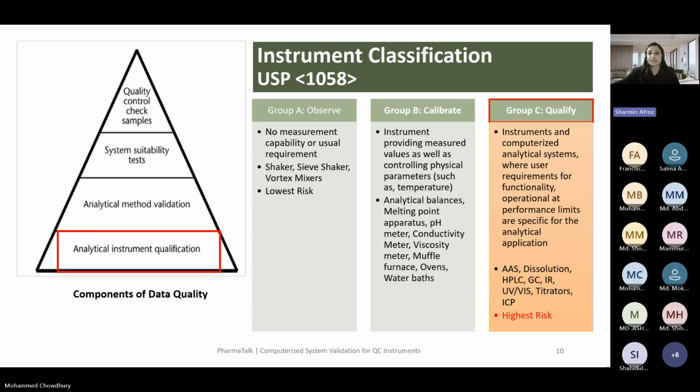Mr. Ashik Mustafa asked, if the autoclave system is not fully CSV validated, how do you know the cycle data cannot be changed or lost? Oh, it's a question from the auditor. They will ask you that because you are the system owner, you are the process owner, and you have to ensure that your data cannot be changed or lost throughout its life cycle. So it's your responsibility to control your system. So it means validation is required.